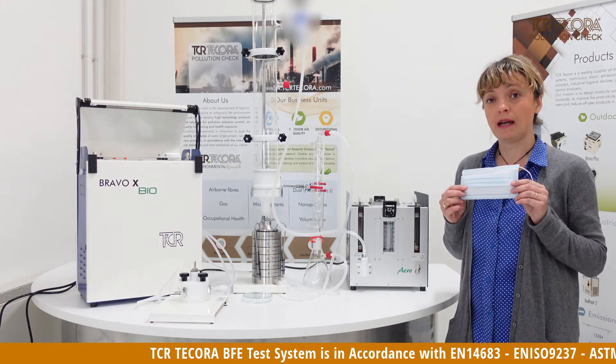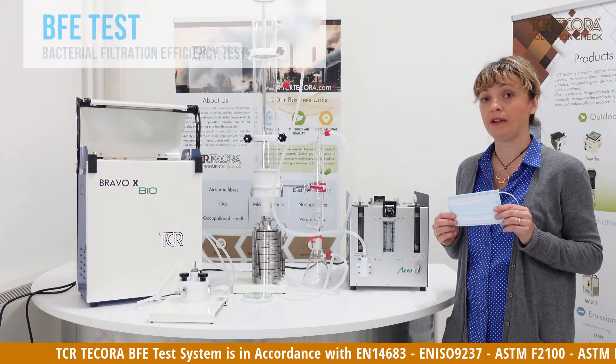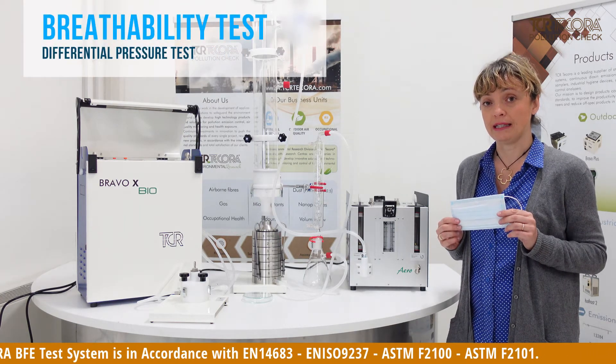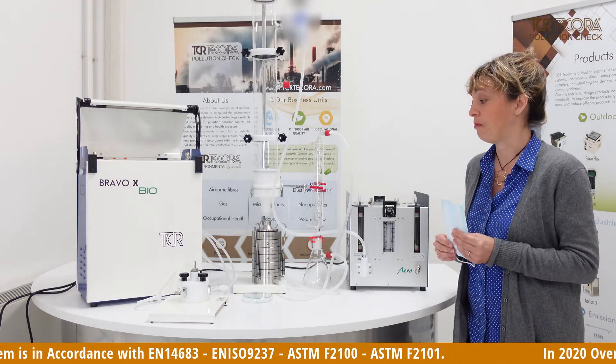This instrumental line lets you test these masks according to the requirements of the technical standards, both for the BFE test — the bacterial filtration efficiency test — as well as the breathability test, the differential pressure test, which are required for these types of masks.